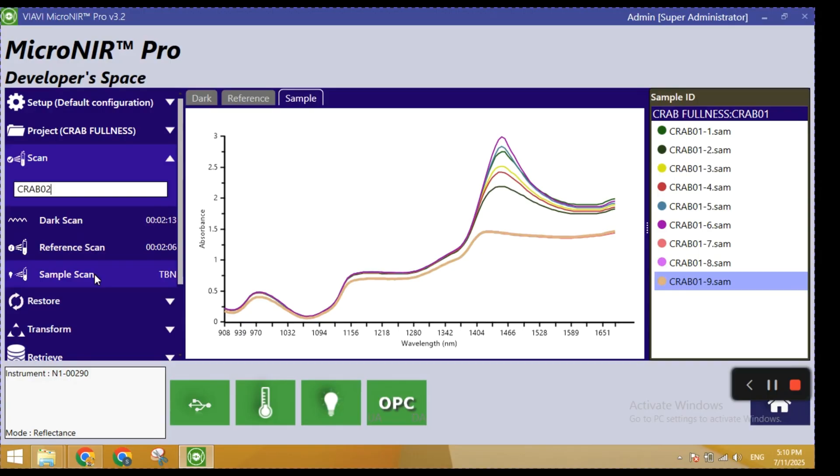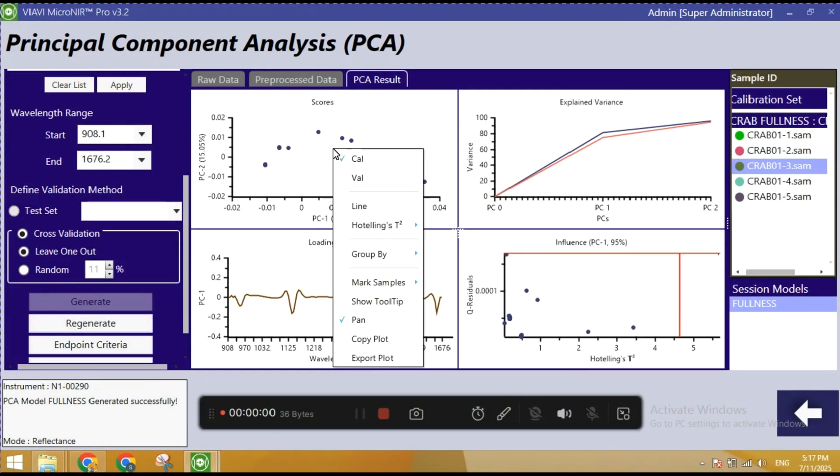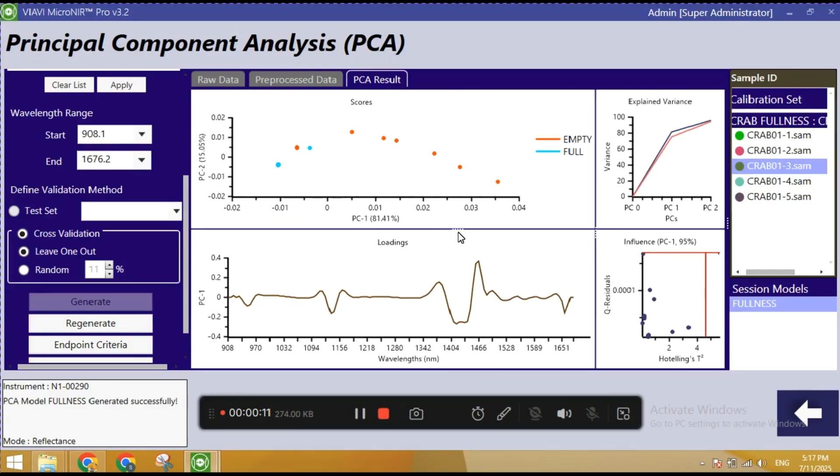This gives us fast and reliable data on key factors like moisture, protein, and fat content — all without cutting or damaging the sample.